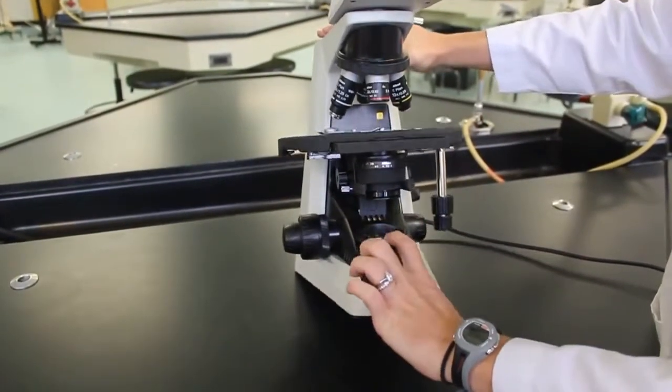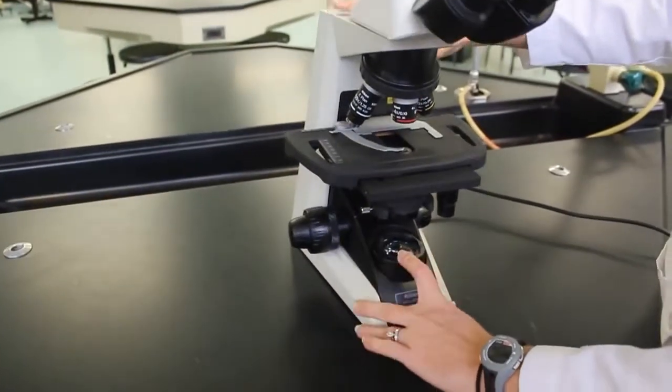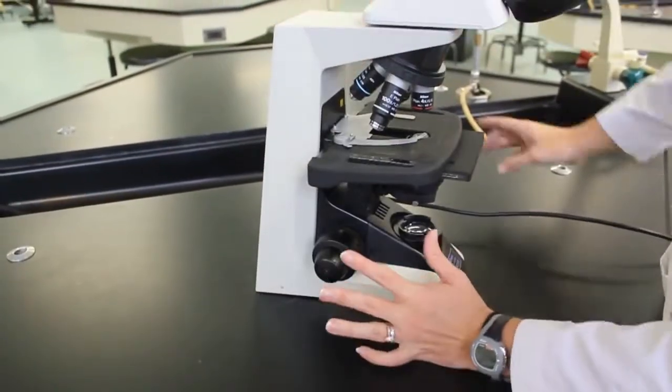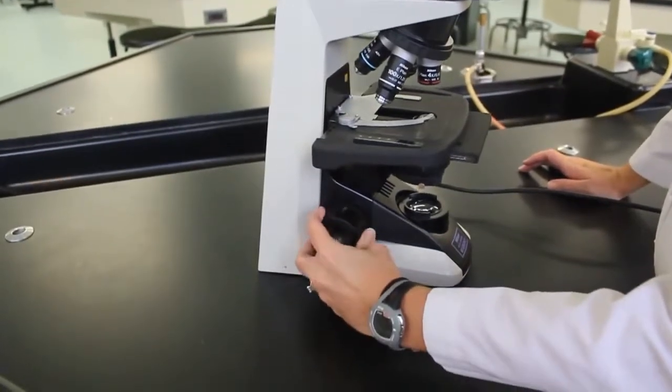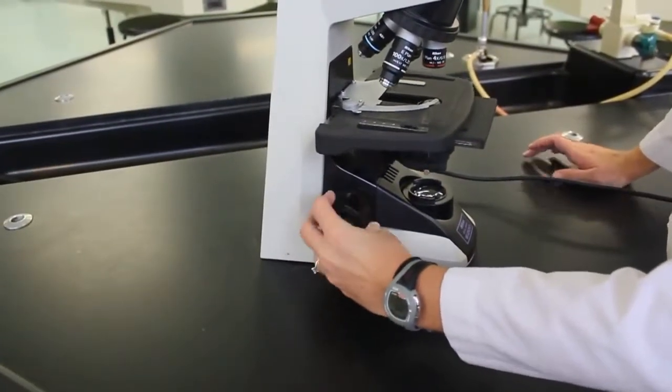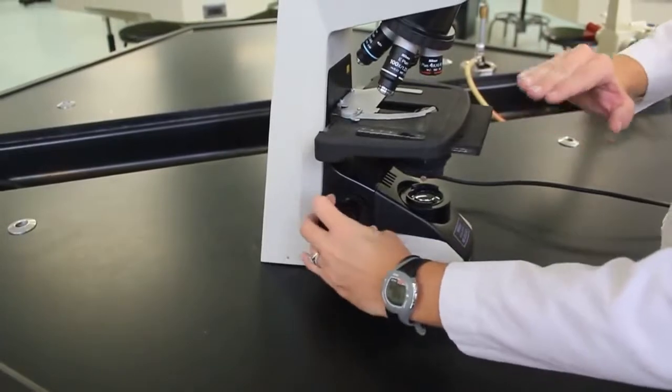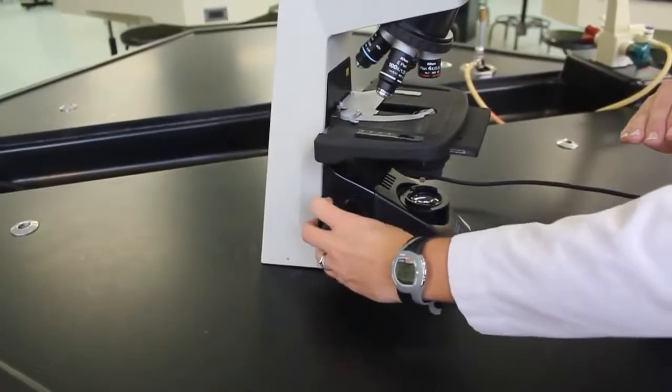Down at the bottom, this is the light source where the light comes from. These two knobs are your focus knobs. The large knob, as I turn it, moves the stage up and down so much that you can see it.